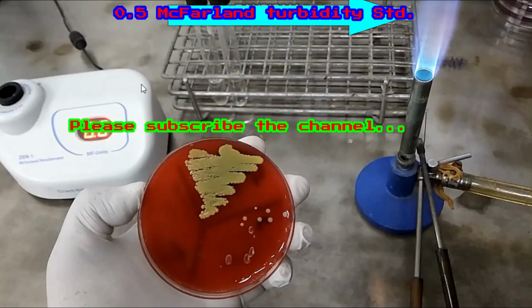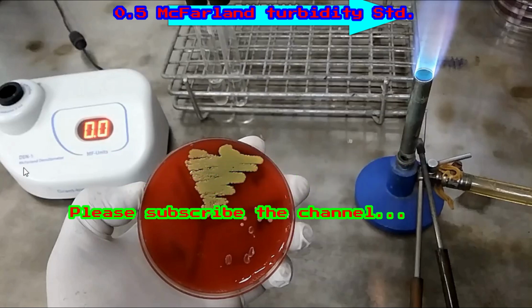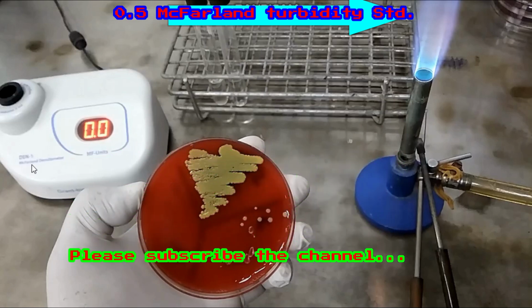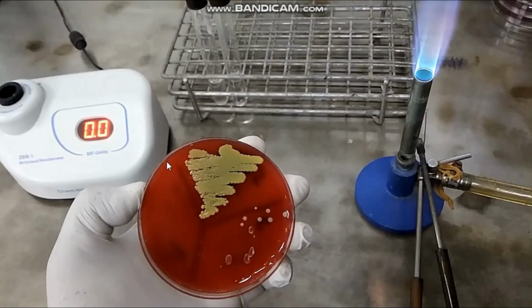So here we have McFarland Densitometer, Bacterial growth culture plate, Physiological saline, Inoculating loop, Bunsen burner and accessories. So let's watch.